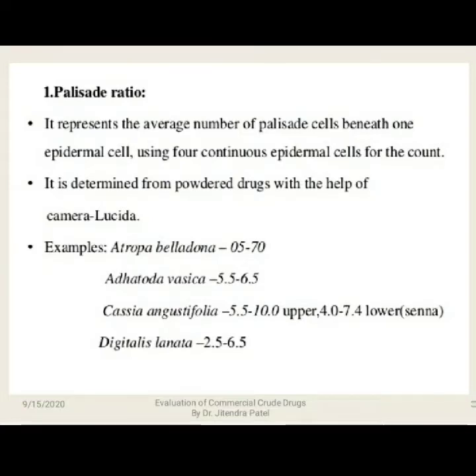So the palisade ratio represents the average number of palisade cells beneath one epidermal cell, right? For each epidermal cell, how many palisade cells are there? Four continuous epidermal cells are used for the count, right? It is determined from the powdered drugs with the help of camera lucida. In the camera lucida, we see the number of palisade cells in each epidermal cell. That will be the ratio. That's what is called the palisade ratio, right?